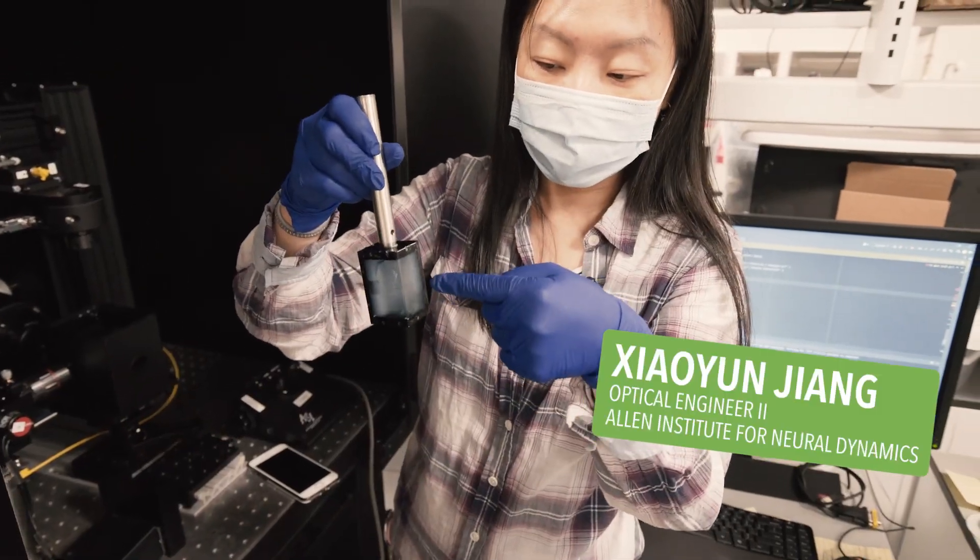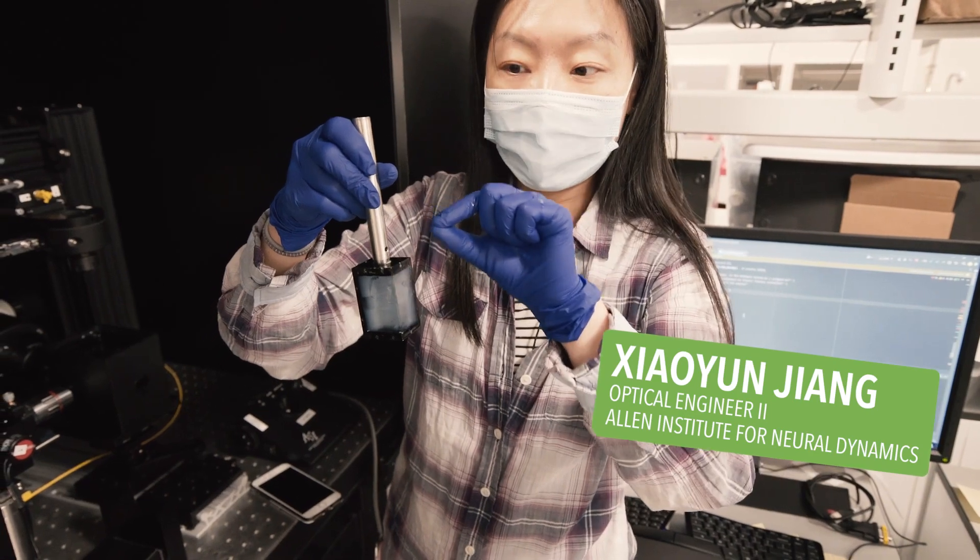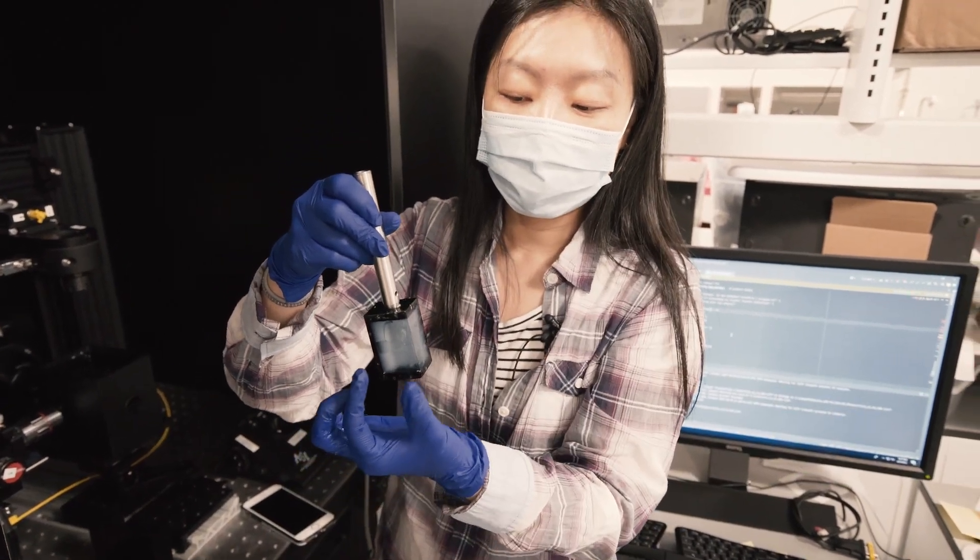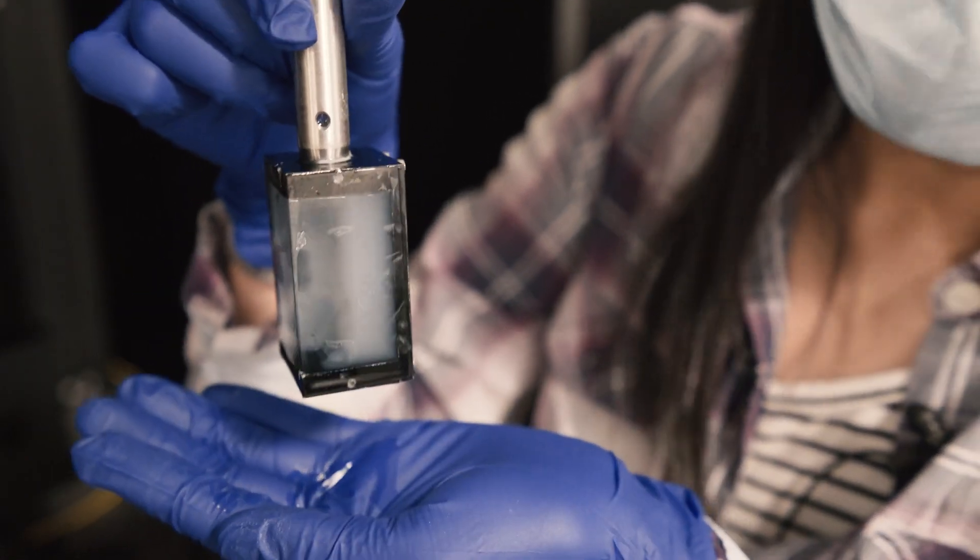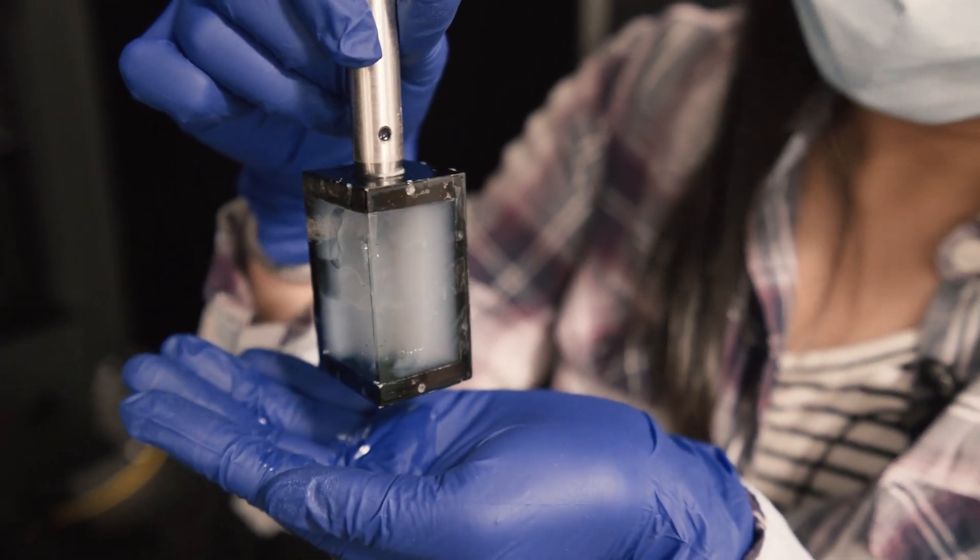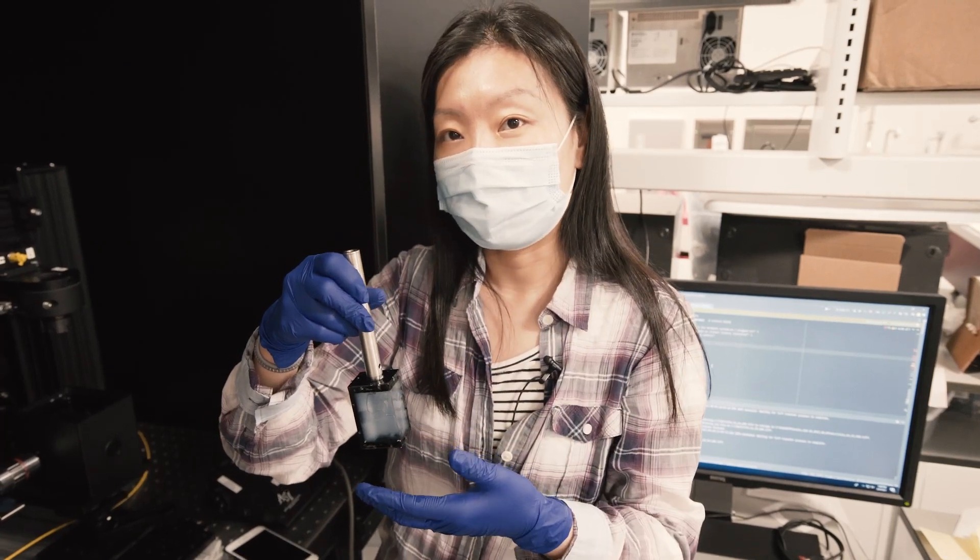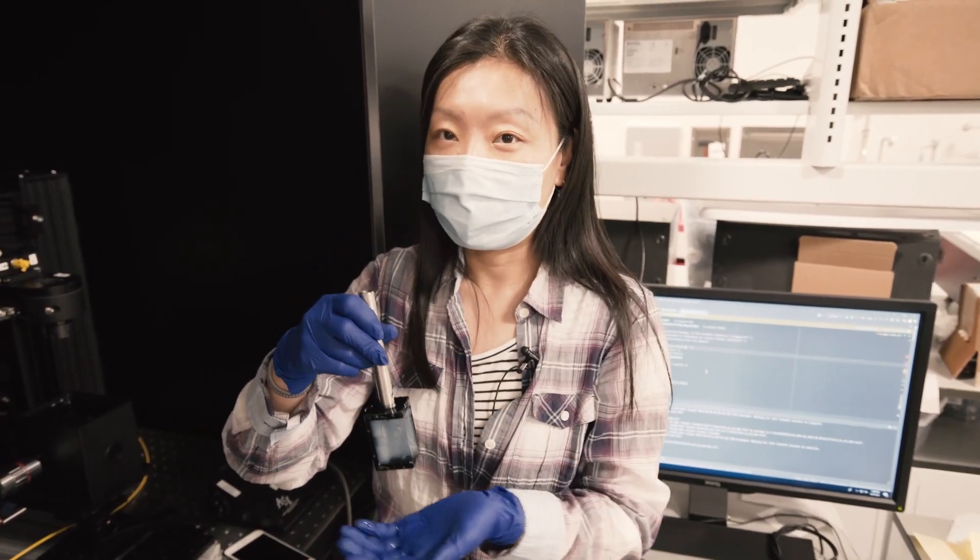You shoot a laser from the side and it's a thin line, and from this side you basically see the width of the line and that's how we form the sheet. The camera is capturing whatever the sheet illuminates and so it will turn into a nice image.